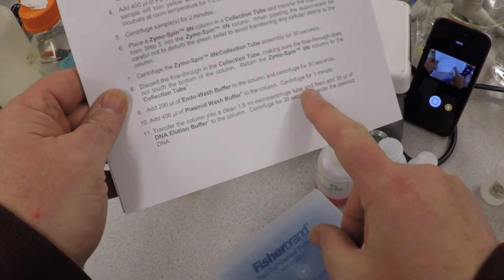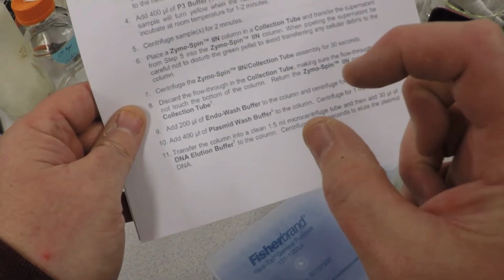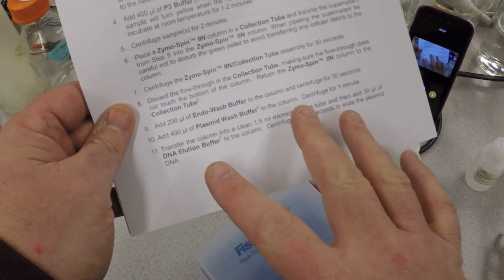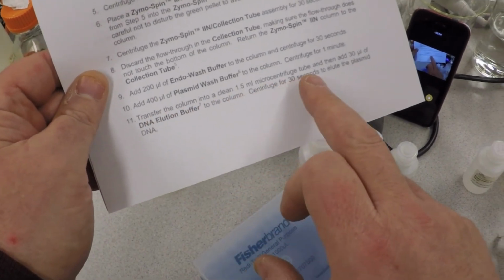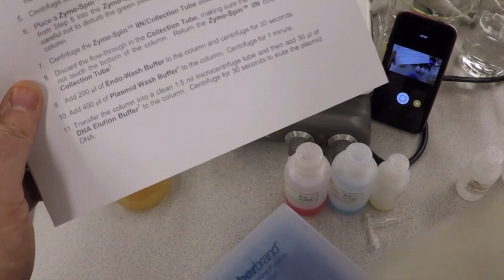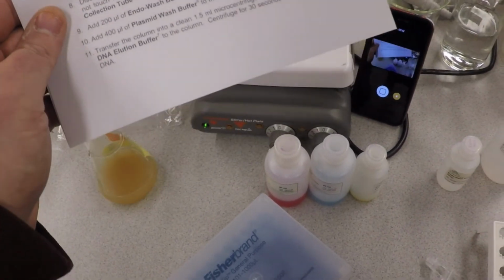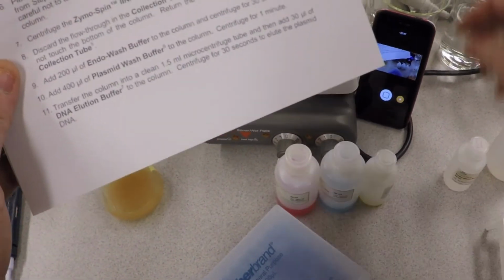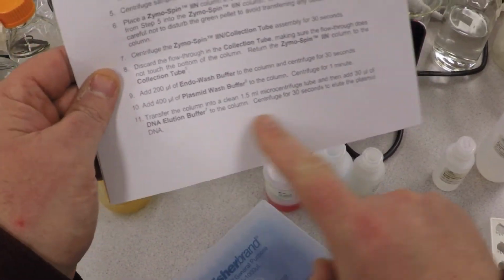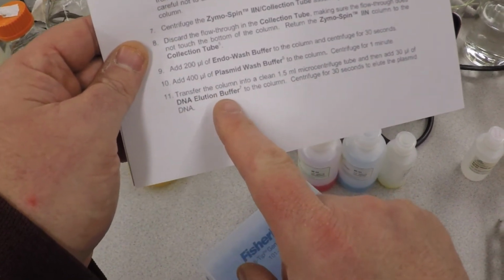So now, after this, the plasmid will still be stuck to that white stuff. Okay, it's still stuck there, but it's washed and clean. Now what we'll do, it says, is transfer the column into a clean centrifuge tube. That's what you're going to collect in. And how do you collect? Well, you're going to hit it with a small volume of what's called DNA elution buffer. This could be water, this could be something called TE buffer.